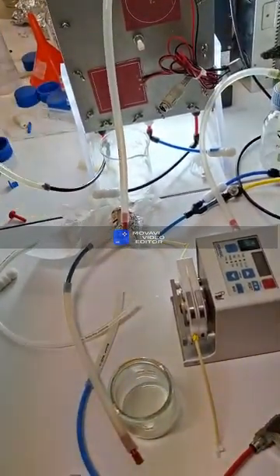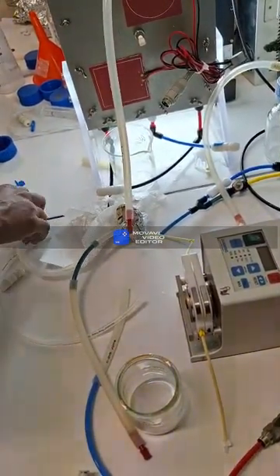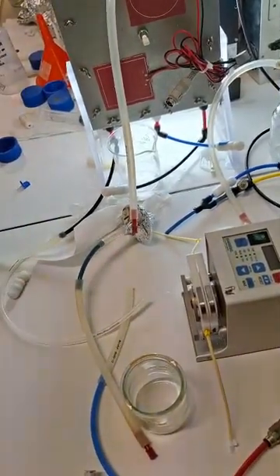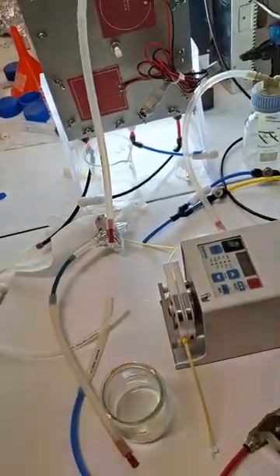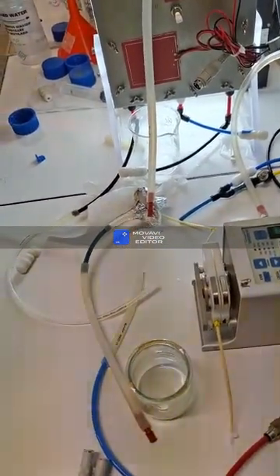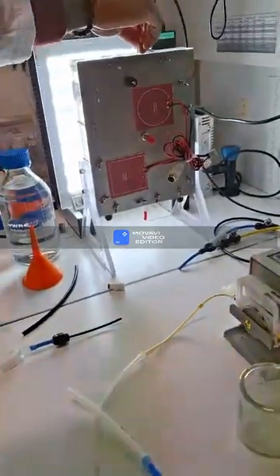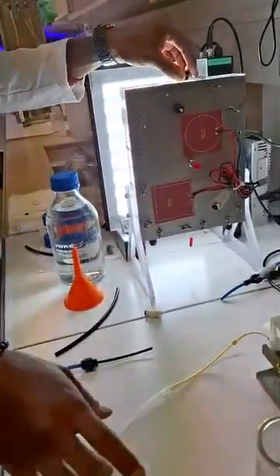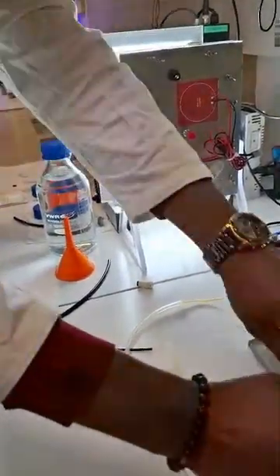Maybe we can put it there and add a connection. No, it's this pipe. We need a connector. The pipe will act as a connector, it will be okay. Yes, this one is perfect. You have to connect it just for the distribution of the salts, the medium culture.